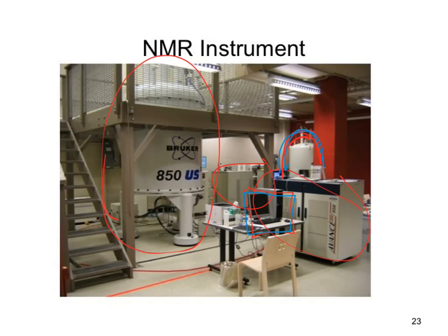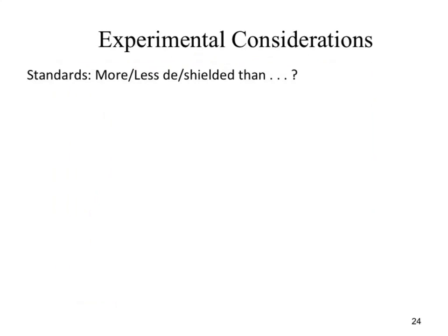A little bit smaller than the size of a straw. Okay, that is where you would put your sample into that massive instrument. So kind of a neat little instrument to play around with. If you move to ASU, there is a researcher there that runs this instrument who really likes undergrads doing research in his work. So if you're interested in that, you should talk to him.